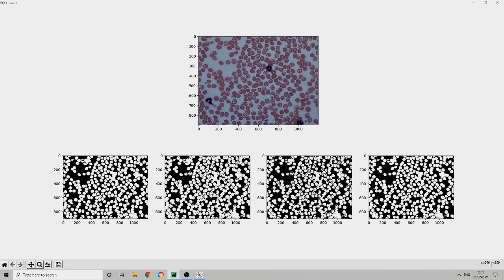And then finally, this is the image closed and then filled. So as you can see, almost every single nucleus is filled, except for this one, which has that really big bridge. There's too many black pixels, so the dilation didn't work, and it wasn't enough to close the cell when we did the closing. So you know what? We're probably not going to get any better than that. One cell out of, I don't know how many is there, 50, 100, is good enough. We can remove that data point later on. We'll remove that cell.